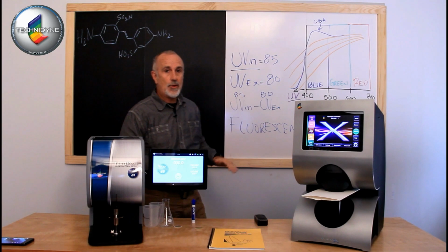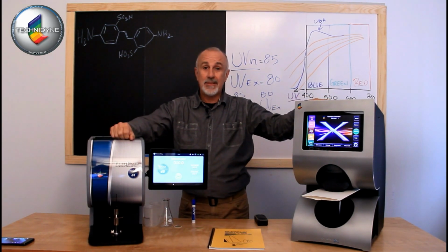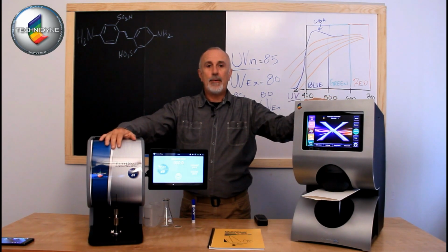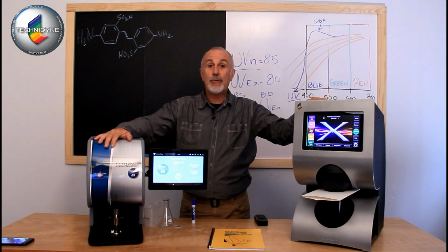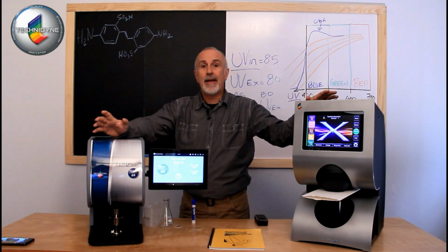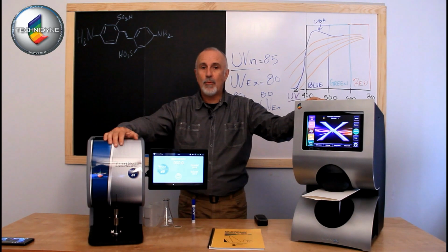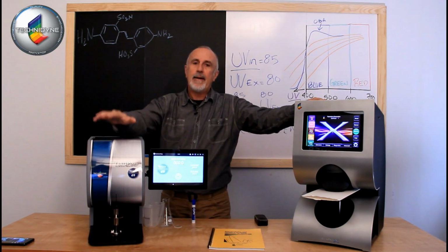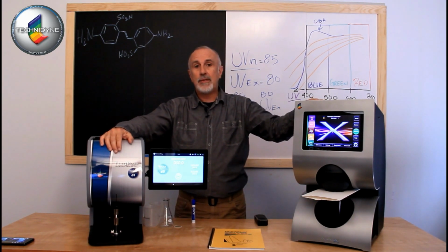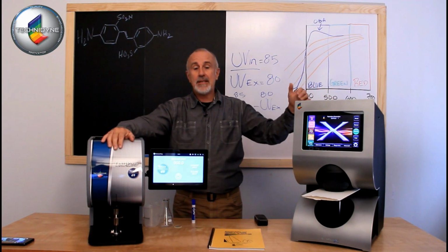Back in the 1950s when ISO was developing these instruments, we weren't really worried about optical brighteners at the time. The amount of UV energy in the light source was really irrelevant for the application at the time. But once we started introducing optical brighteners into the paper itself, we had to come up with a way of measuring the effectiveness of that. So we did that through this method.